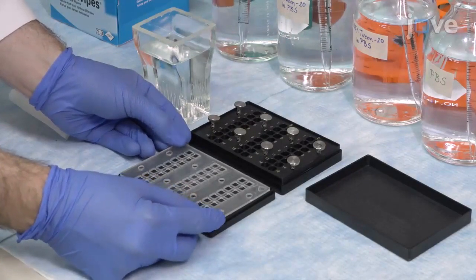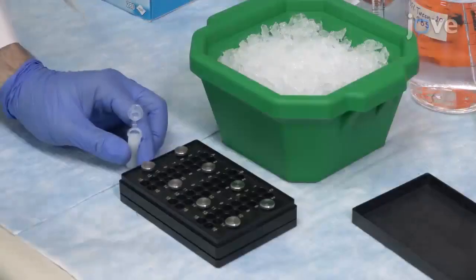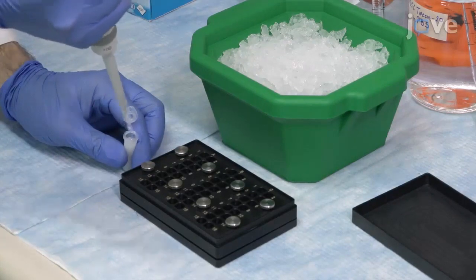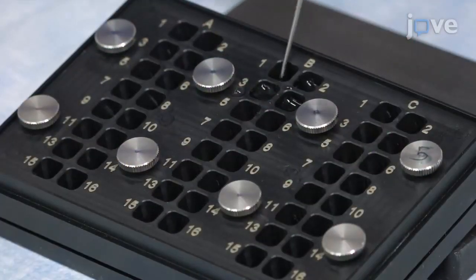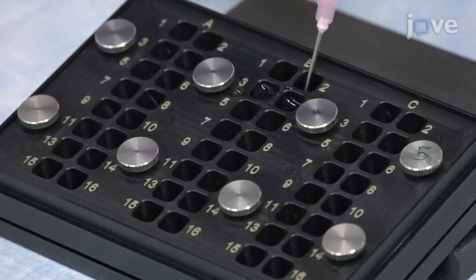The tested enzymatic activity depends on the insight from the microarray experiment and is lower throughput in its nature. The link between the efficiency of binding, DNA sequence selection, and the activity of the enzyme is probed.